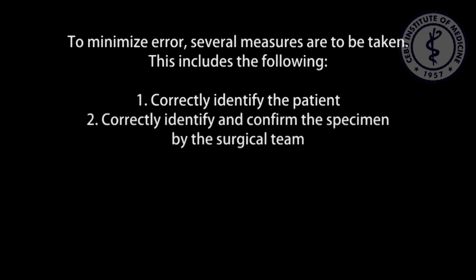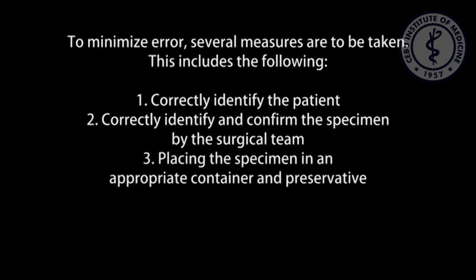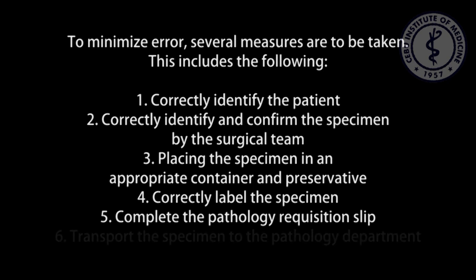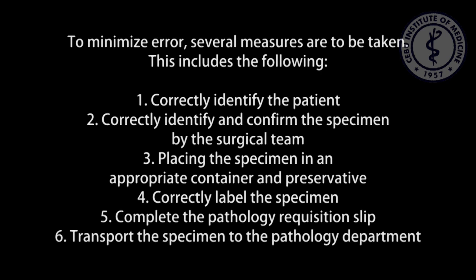This includes the following. 1. Correctly identify the patient. 2. Correctly identify and confirm the specimen by the surgical team. 3. Placing the specimen in an appropriate container and preservative. 4. Correctly label the specimen. 5. Complete the pathology requisition slip. 6. Transport the specimen to the pathology department.